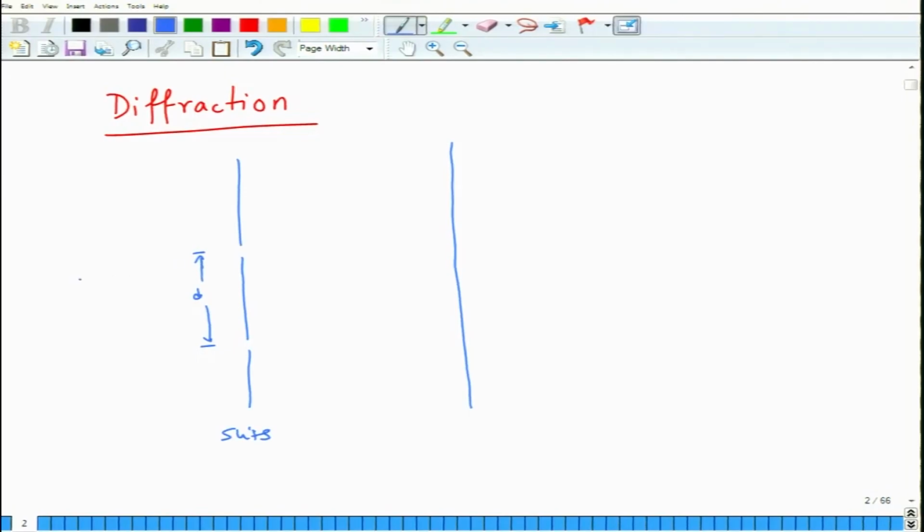When the light struck them at a certain angle, he observed a pattern on the screen, which was a fringe kind of structure. It is not very nicely drawn, but nevertheless you understand what I mean.